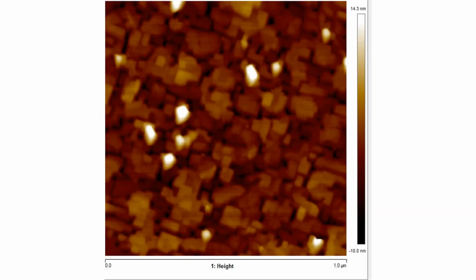Looking at some more samples, now this is the optical image. So looking at our setup, in the black, this tip shaped structure, that's our tip, and that's hovering over top of a very flat substrate, some crystals growing on a substrate. So the previous image was the optical setup of the sample that we're currently looking at.